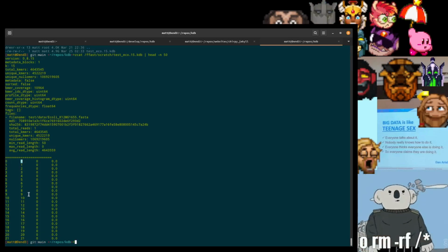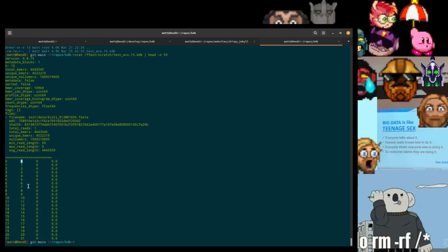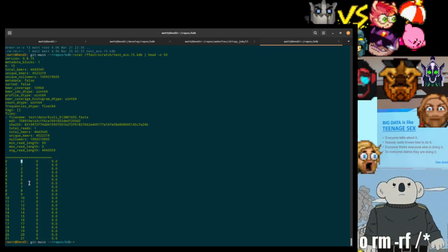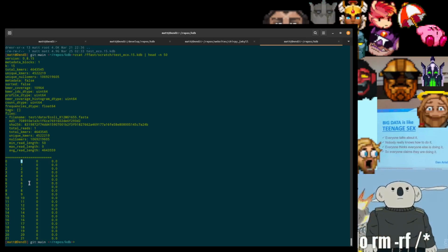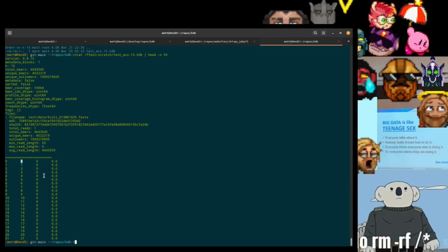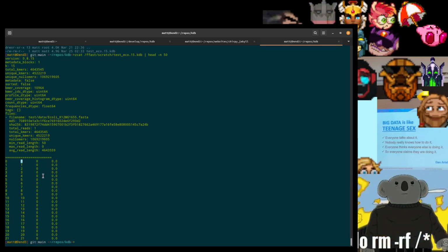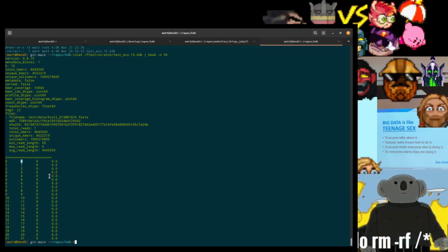This is again a reminder, the leftmost column is just a column ID. The second column is a kmer ID. And this has to do with the way the indexing and bit shifting works. It's not a UUID or something arbitrarily chosen. It's just a numerical representation converting the sequence.